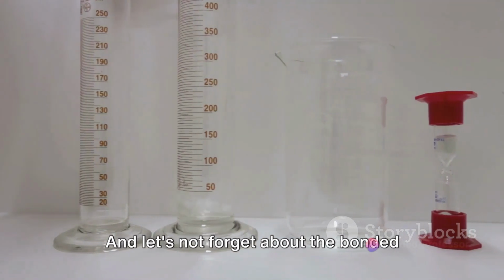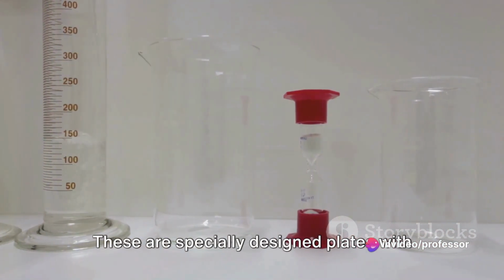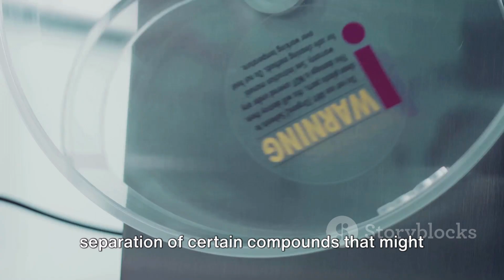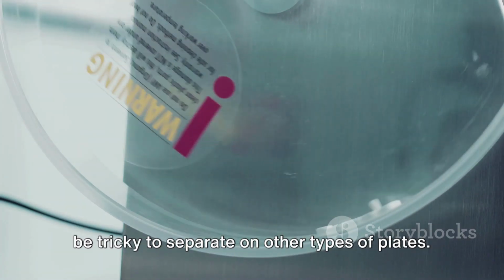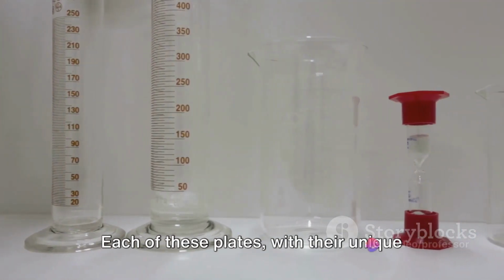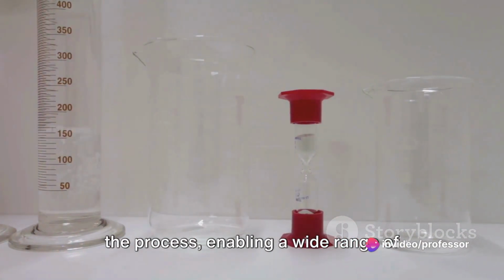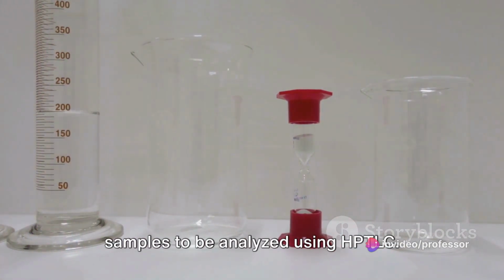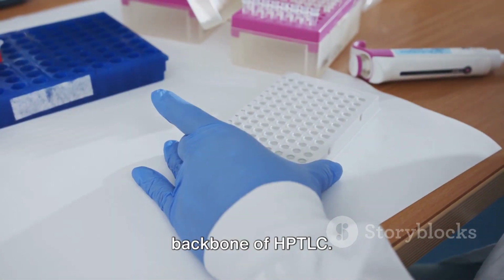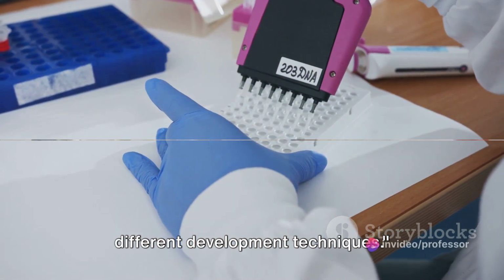And let's not forget about the bonded phase plates. These are specially designed plates with chemically modified surfaces, enabling the separation of certain compounds that might be tricky to separate on other types of plates. Each of these plates, with their unique characteristics, play a critical role in the process, enabling a wide range of samples to be analyzed using HPTLC. These instruments and plates are the backbone of HPTLC. Next, we'll look at how they're used in different development techniques.